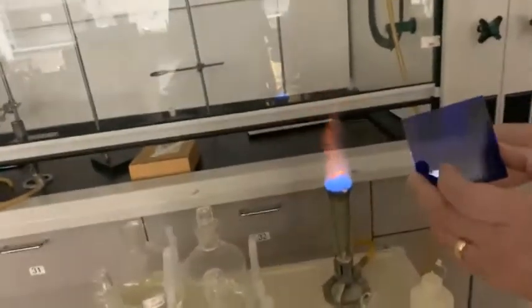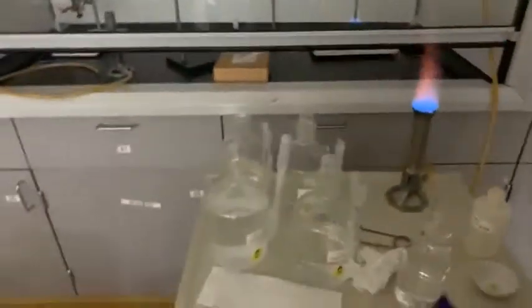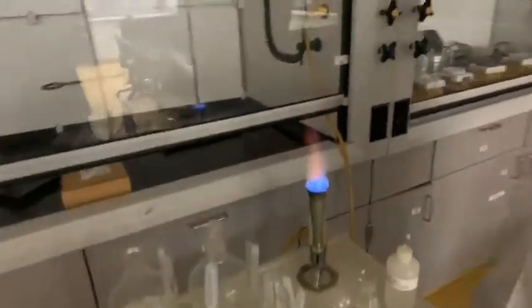Do you see it through the camera? Yes, see, the flame basically disappears. There's some residue in there, but orange flame, no flame. Okay, everybody see how that works? Okay. Are we done? We are done.